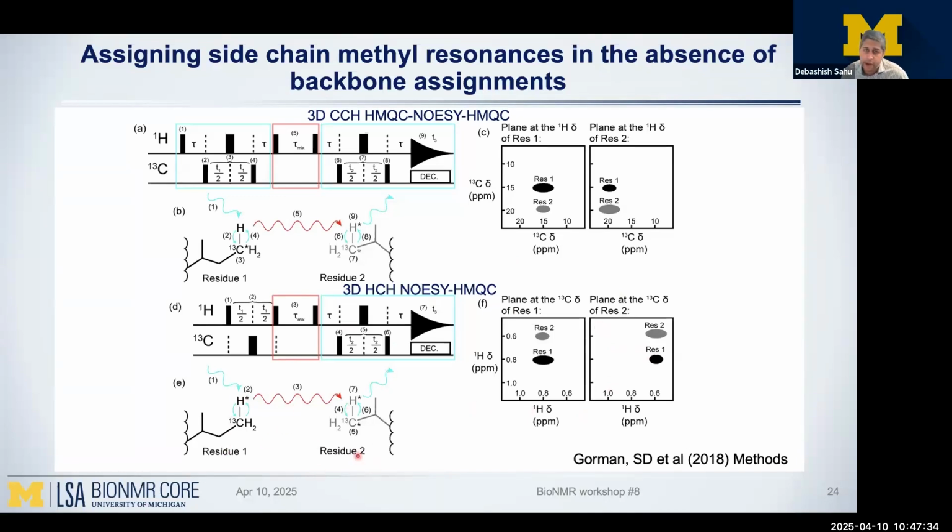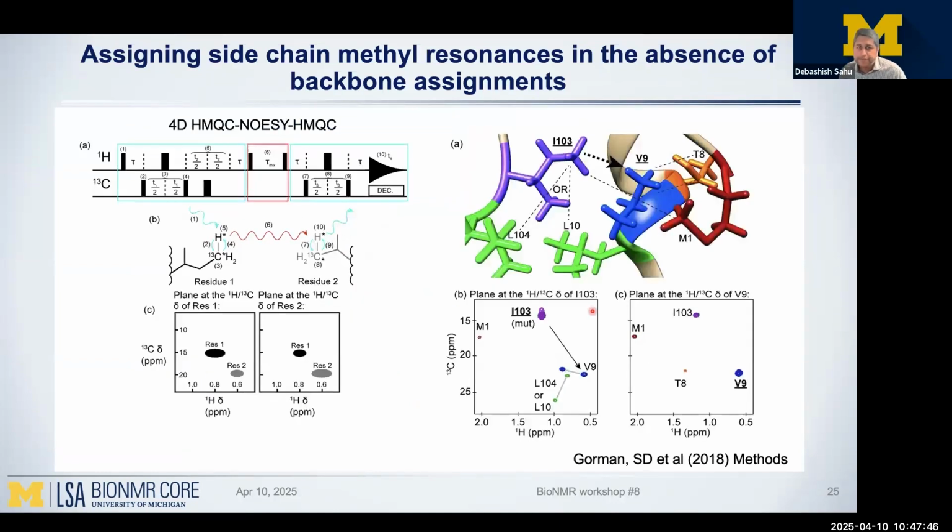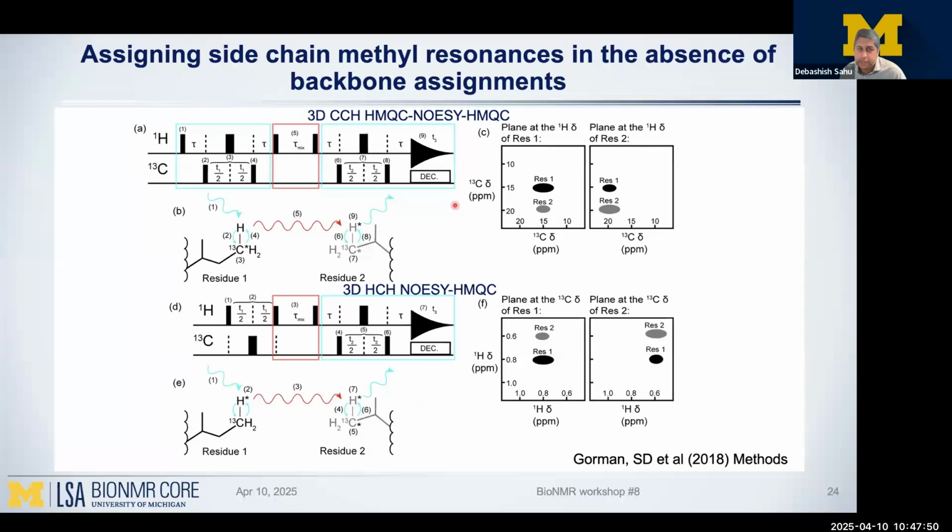So this will simplify a lot of things. The more dimensions that you add, the easier it makes your life. And then you can also use NUS, because you have more dimensions, and make use of the NUS principle. Not only that, you can combine these two techniques.